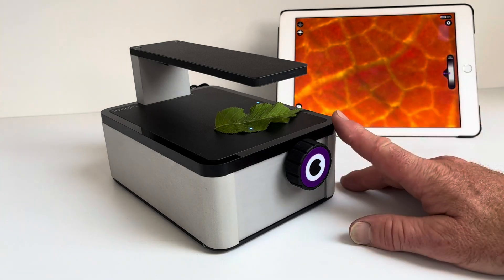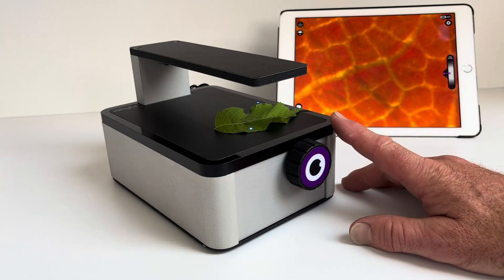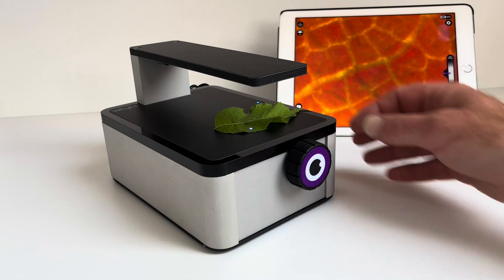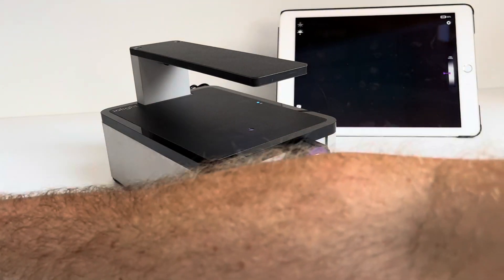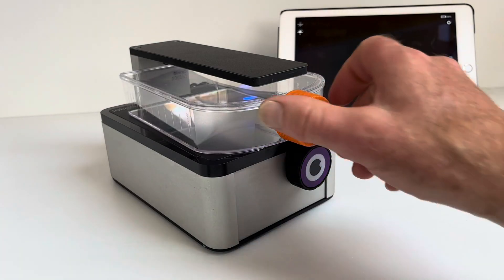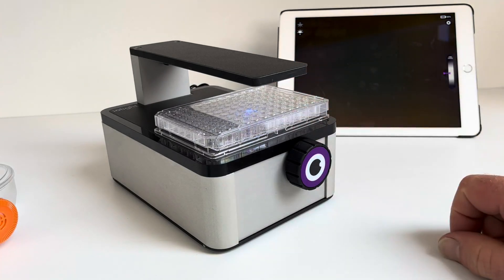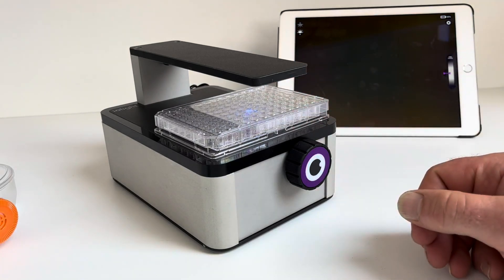This is a great little compact microscope, particularly for confined spaces where bench space is limited — incubators, glove boxes, things like that. It might commonly be used with a tea flask, something like this, or it'll image at the bottom of a well plate. Great for cell culture work and things like that.